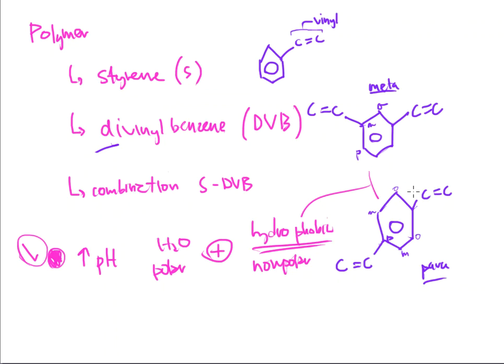So we modify the surface. We put these pretty little functional groups on them, like positives and negatives. And that way the water comes around and the water sees what's on the face. That's it. Just face value. And those positives and negatives are there, and that water molecule will hang out, and those cations and anions will hang out on the surface. And that's really all they care about. I hate to say it, but they just care about what's on the surface. And then they go on to the next particle, to the next one, to the next one. But all at the same time, these things can withstand very high pHs and they will not dissolve on us.